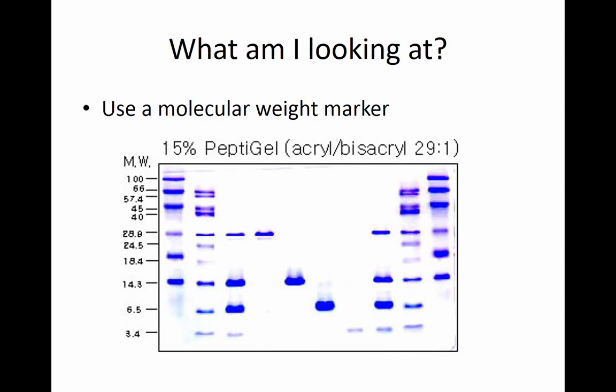Okay, so what am I looking at? How do I know what these proteins are? They're just a bunch of bands to me, right? Well, what difference does it make? Well, you figure that out based on the molecular weight marker here.